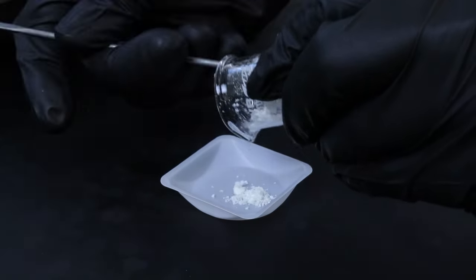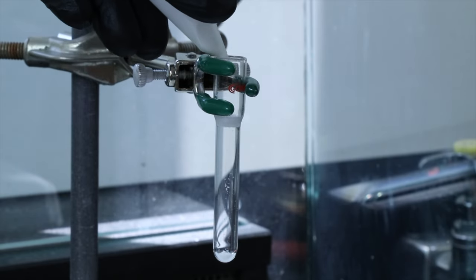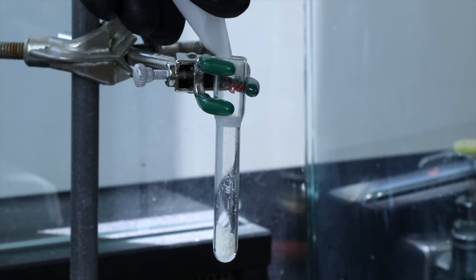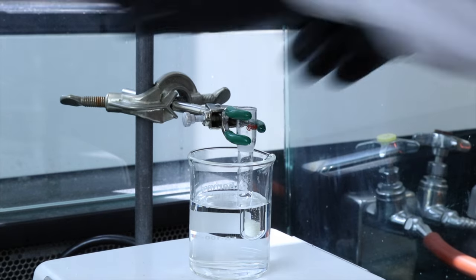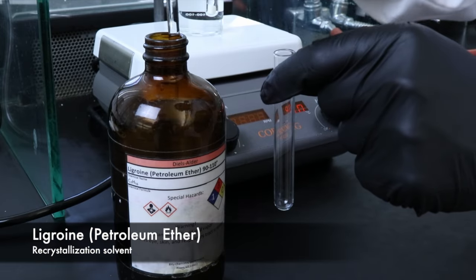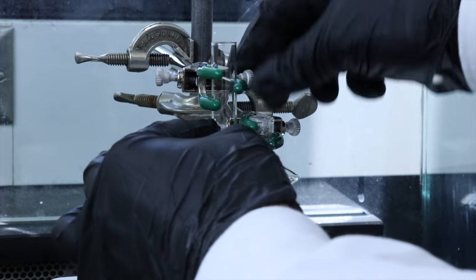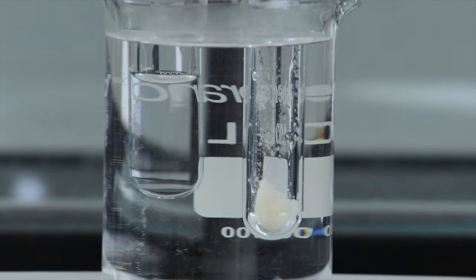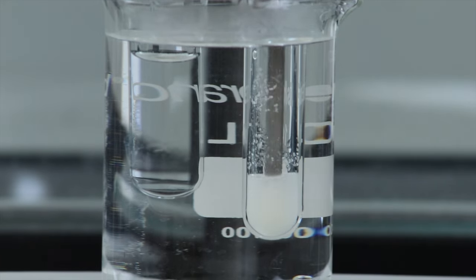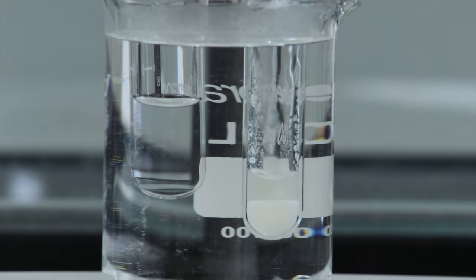And now I'll be transferring that crude product to a Craig tube so that I can purify it through recrystallization. I'll place it in a hot water bath so that it can be dissolved at high temperatures using ligroin as the recrystallization solvent. And I'll place that in the hot water bath as well so that it's also at a higher temperature. Now I'll start working on dissolving the alcohol product by slowly adding ligroin and stirring it, just so that I add the minimal amount of solvent to dissolve it at higher temperatures.